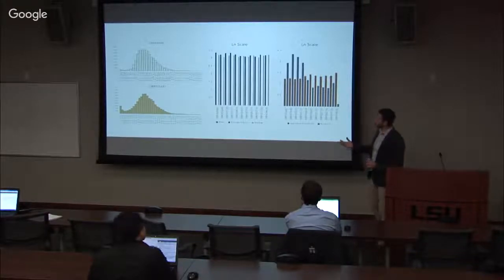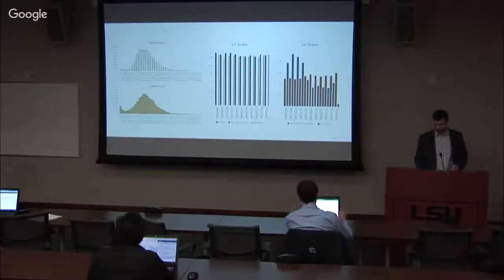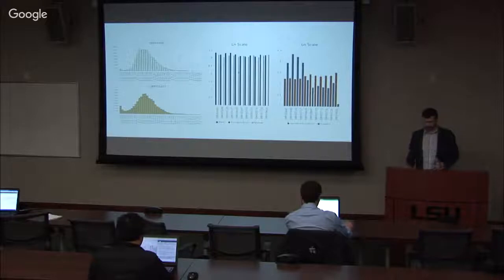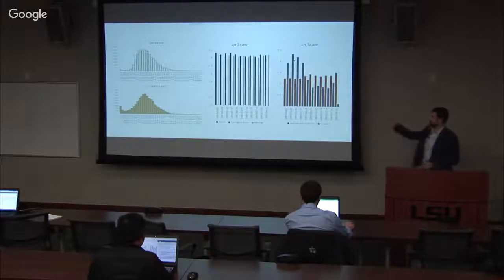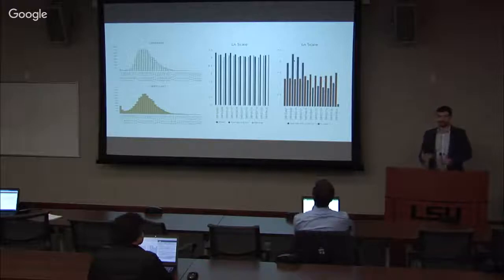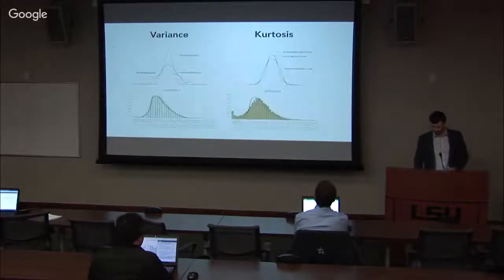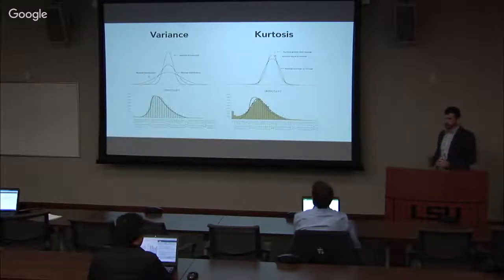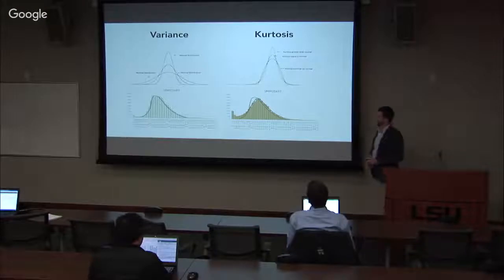And now you can start seeing other things that emerge from this transformation. For example, right here, the mean and the median and standard error are about the same, but all of a sudden kurtosis is sticking out right here, right? So you can see that for the normal light, it's much higher. And this brings us to another point that is going to be very important about our data, and that is variance and distribution of values that we want to take a look at.